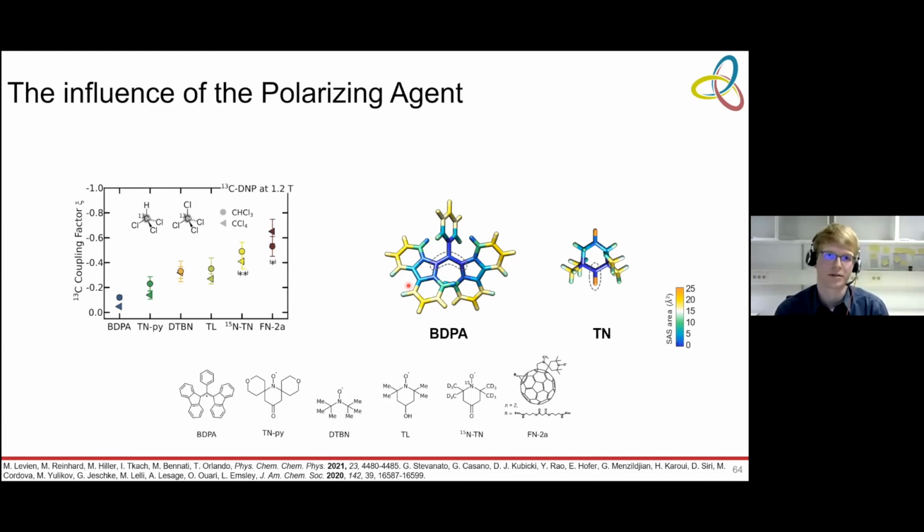On the protein, but also on the radical. And if your radical is small enough, your molecular collisions can still be fast enough to get signal enhancements at molecules that are as big as proteins.